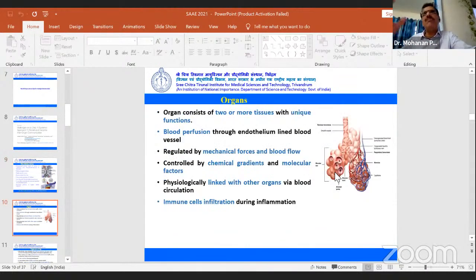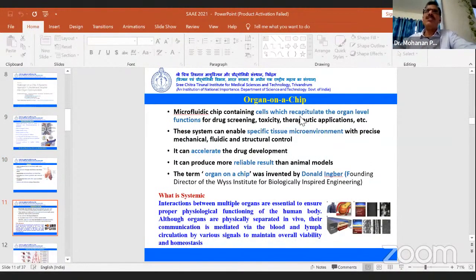In the same way, we incorporate this into a micro device like the organ on a chip, multi-organ on a chip, or human on a chip. The main function is to simulate these functions in an alternative way. Let me go to the organ on a chip. Everybody knows it. For the last several years, this has been talked about by everybody. In the new generation, you can apply the advanced version of this organ on a chip to evaluate the biological response or disease modeling in different aspects.